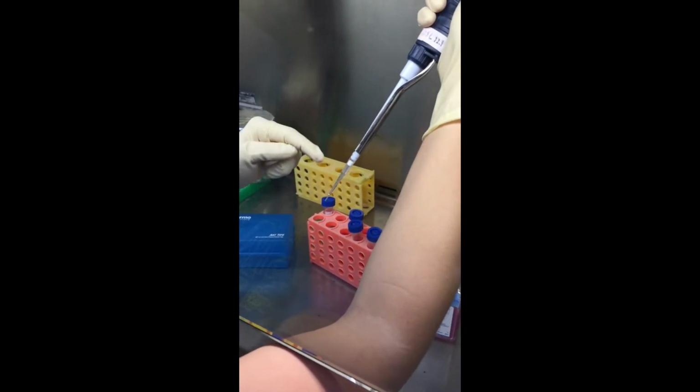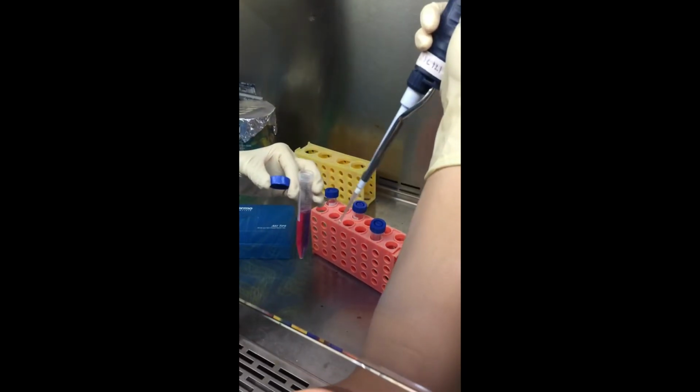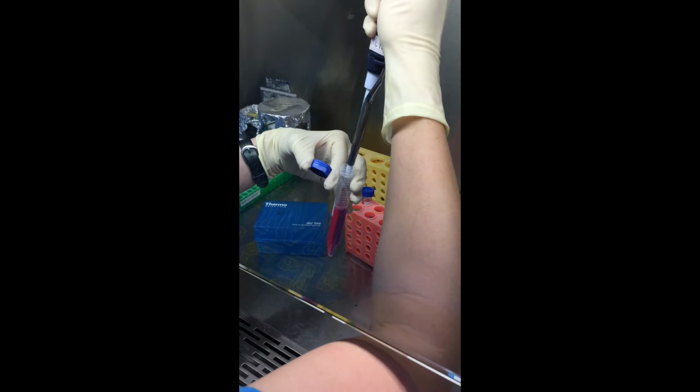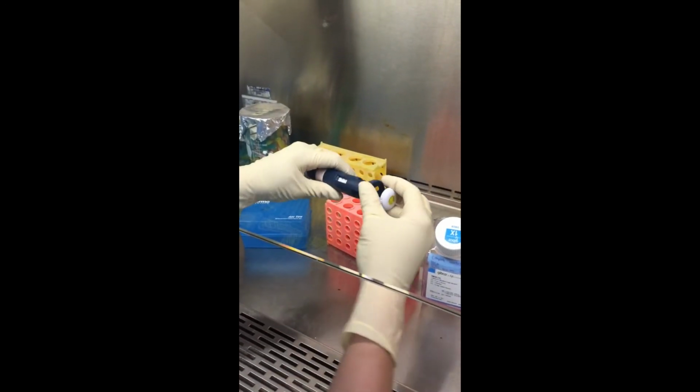Always check and make sure there aren't any bubbles. Sometimes if you pull up on the stopper too quickly, you'll get bubbles in there and you won't have an accurate volume. And the last one is 48.